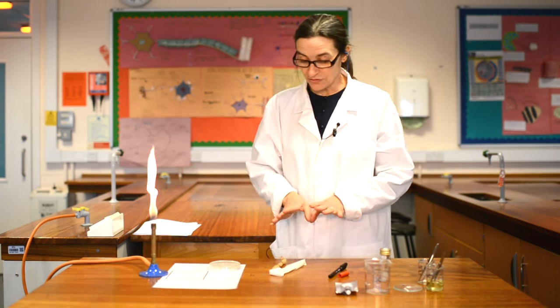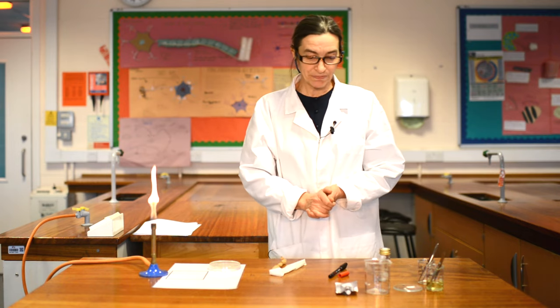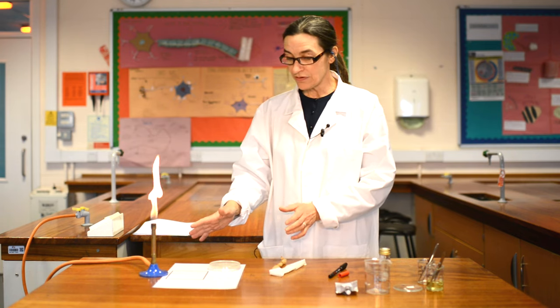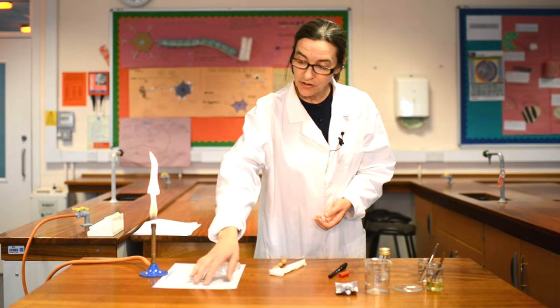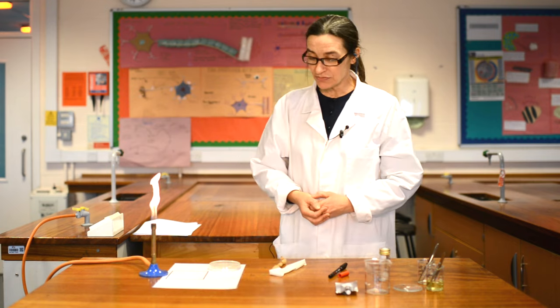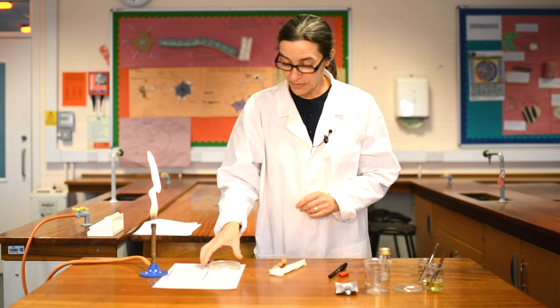Nevertheless, we have to do everything as though we were handling a dangerous microbe. The first thing you would have done before you got this far would have been to set up your equipment, wash your hands very thoroughly, and remove your work mat from the sterilising solution in which your teacher would have placed it. Before we start even handling the microbe, we're going to get the agar plates ready.